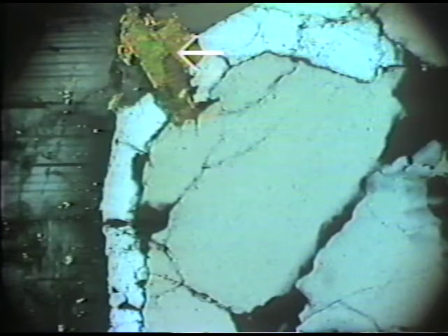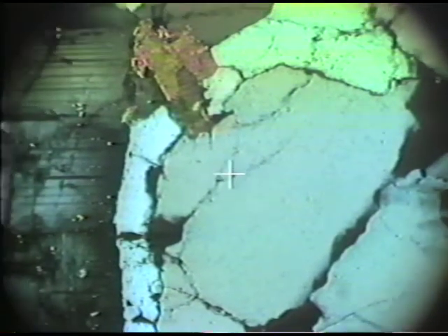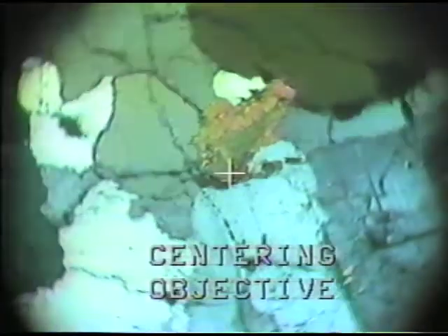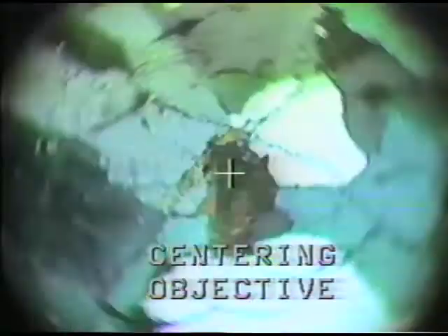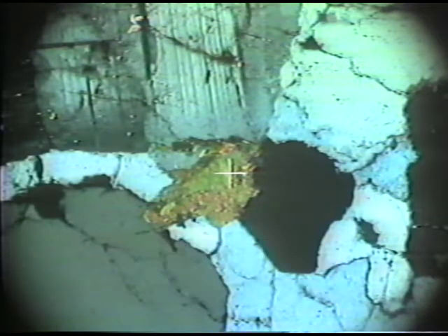Now I'm going to move the centering screws. Remember their position on the objective itself, and I'm going to move these centering screws until that biotite occupies the center of the field of view, that is, coincident with the crosshairs. And now I can show you that with rotation this objective is correctly centered, and I'm ready now to use that objective. Both your medium and your high power objective should be centered each time that you sit down at the microscope.